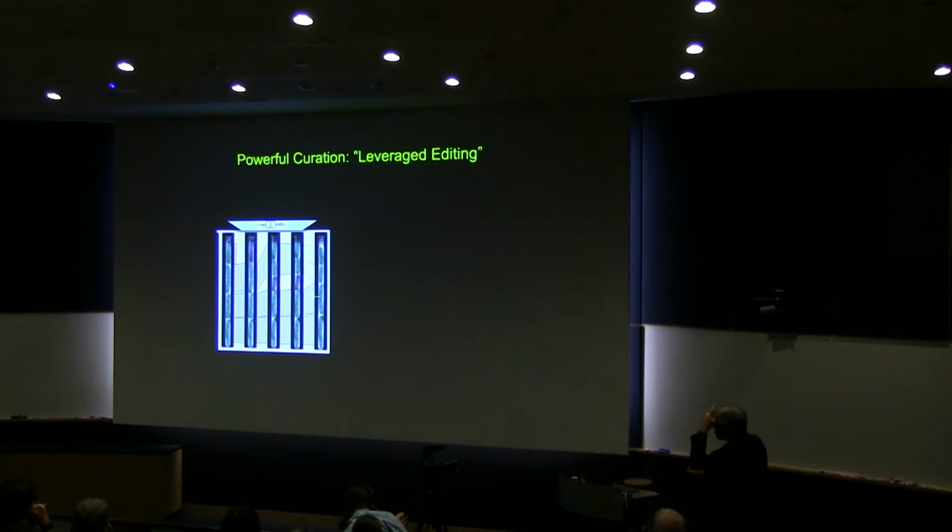But here's an example where our 1D tracker completely blew it. Here you can see it missed that cell for some reason or another. It thought this guy disappeared when in fact it's still there. I'm not sure why it went so far out. This guy goes downward and, okay. But what's really cool is if you think about it, in the background, I have this set of equations that constrain what the answer is, okay? So how do I curate this situation? Very simple. There are actually 13 mistakes, by my count.